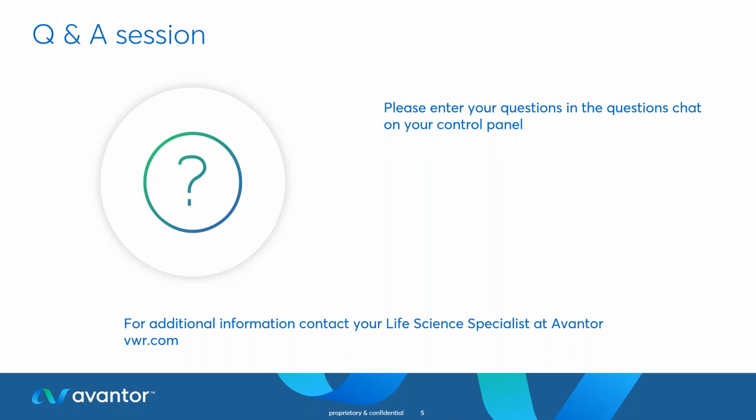And then we have another question. How do you address the inaccuracy of base calling homopolymers? Yeah, so that's a really great question and is actually addressed by our new R10.4.1 nanopores. Those pores have a dual reader head. So we've increased the sensing region within the pore itself. It's almost like your fragment that's being translocated is being read twice.